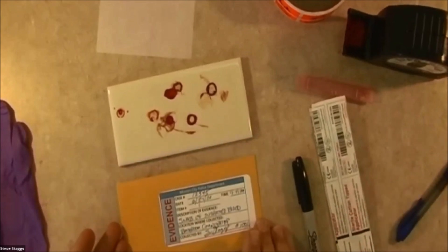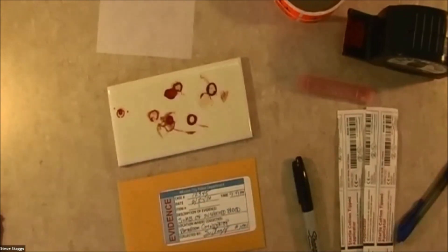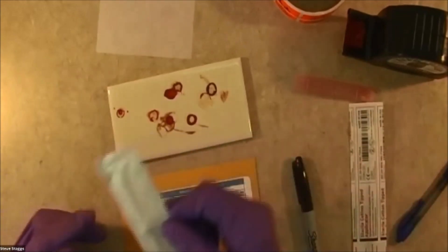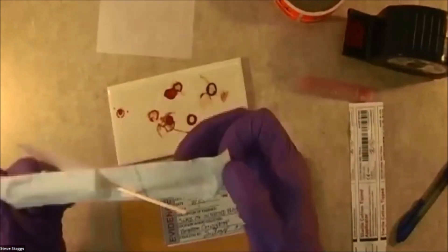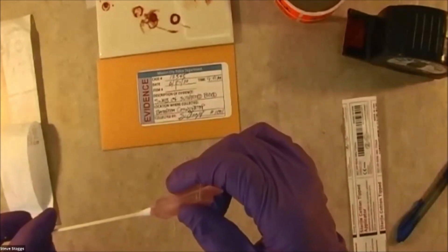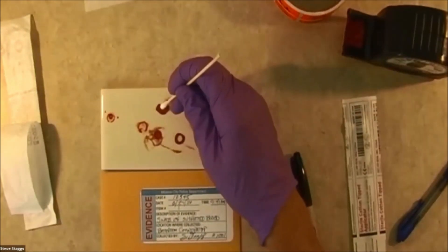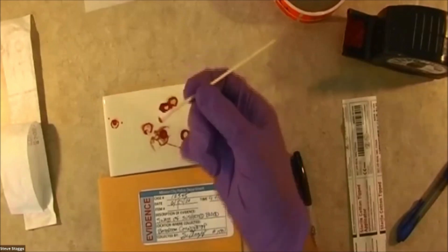I have gone ahead and filled this out and I am now all ready to do my collection. So what I'm going to go ahead and do is put on my gloves and go ahead and open up one of my swabs. These are sterile, so we open them up and here is our swab. Now what I need to do is add two drops of distilled water on it. So now I can do my sample here and I'm just going to rub it firmly — the tip. Rotate it. And that is plenty.